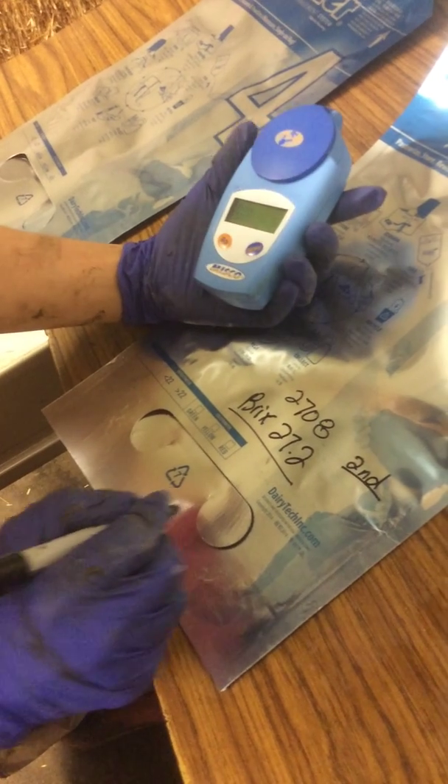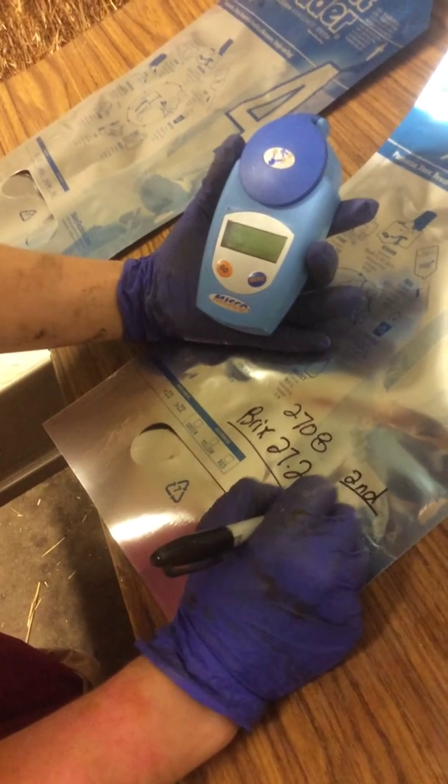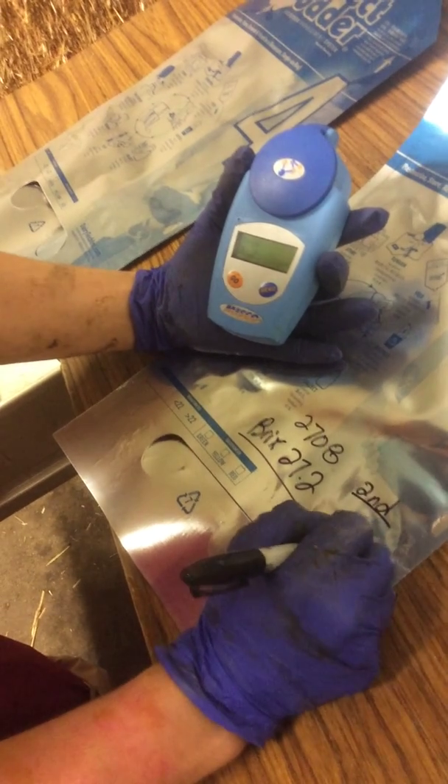The label also includes the milking number — first, second, third, etc. — as well as the date.